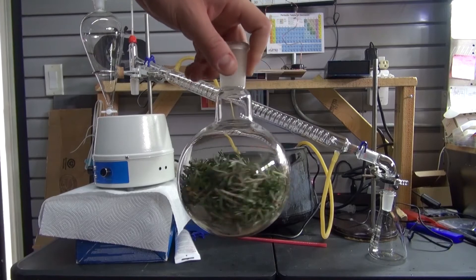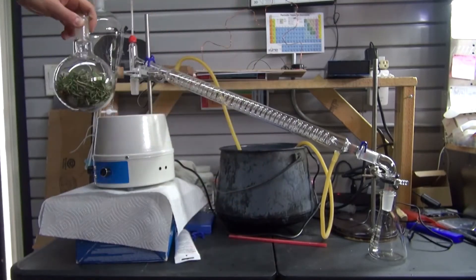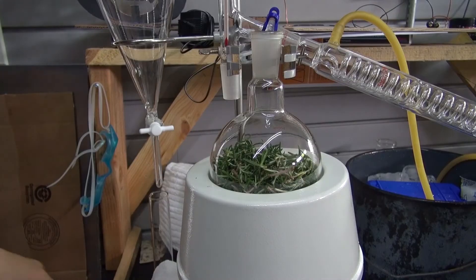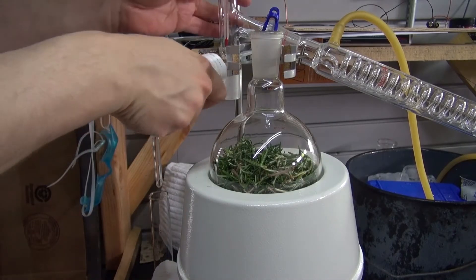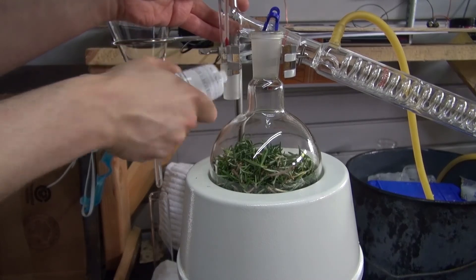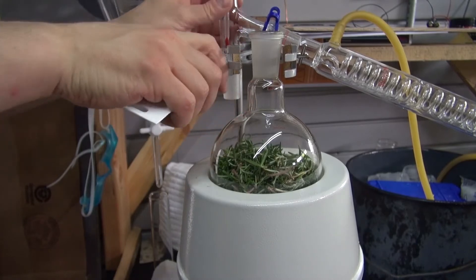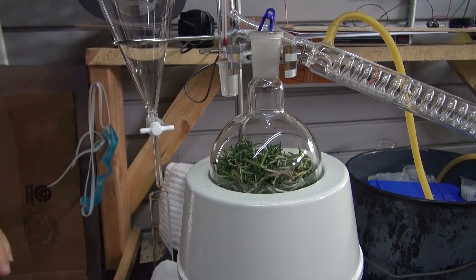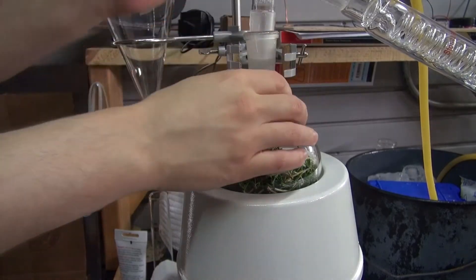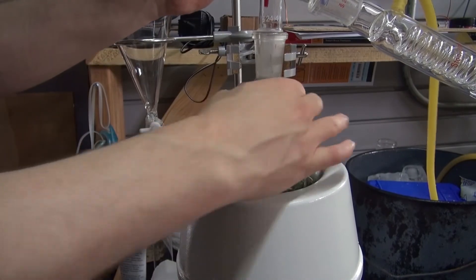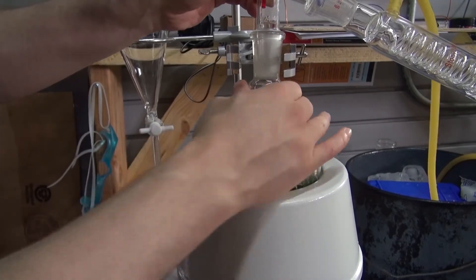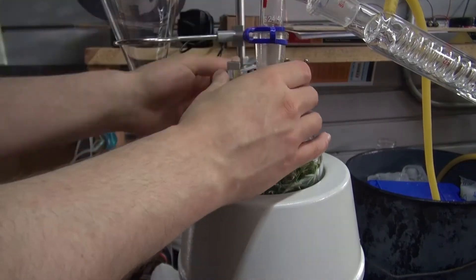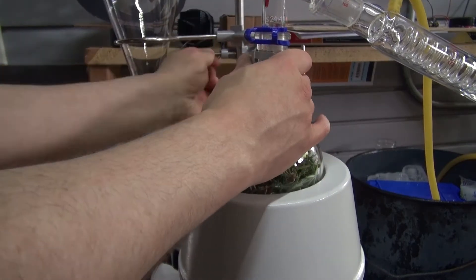Next I'm going to take this Florence flask that's filled with rosemary and place it on top of the heating mantle. Then take some food grade vacuum grease and put it onto the thermometer joint. Now take this thermometer joint and connect to the Florence flask and twist the flask to spread the grease. Put it into place and put all the clamps together. It should look just like this.